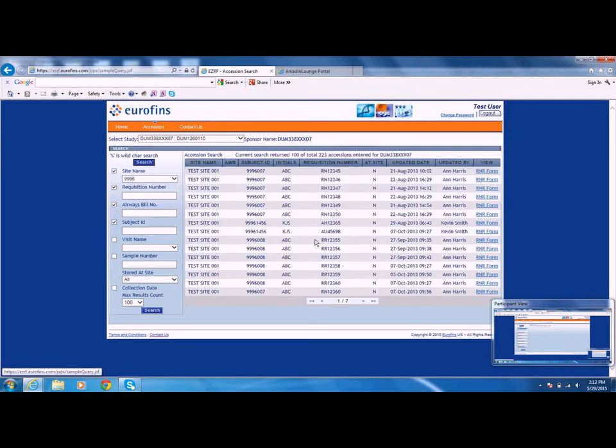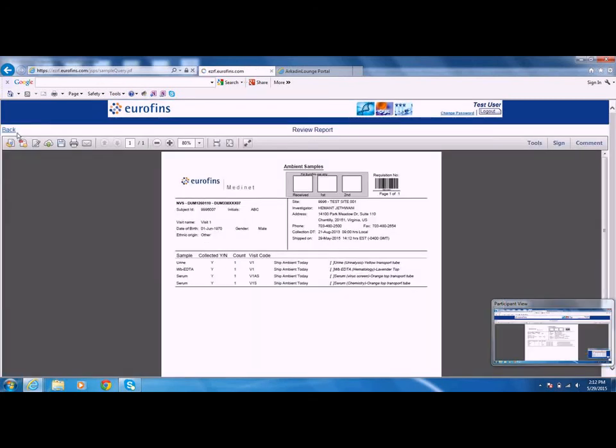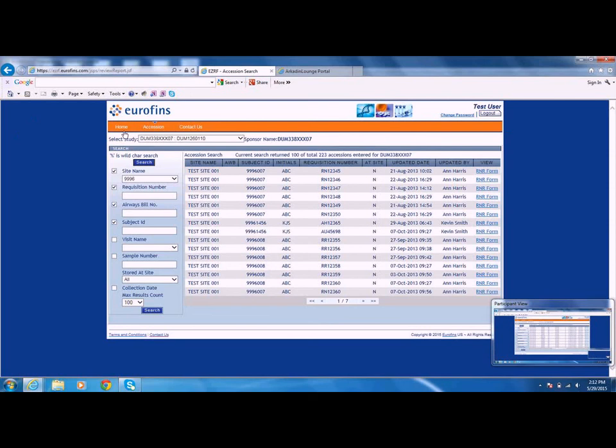So let's select the site number here and click on search. So the system would give us all the forms that were completed for that particular site. As you can see, we have all these different requisition forms that were completed. Now, in the last column, you have the links where you could click and actually see the PDF version of the form and also print it out if you wanted to by clicking on that print file button.